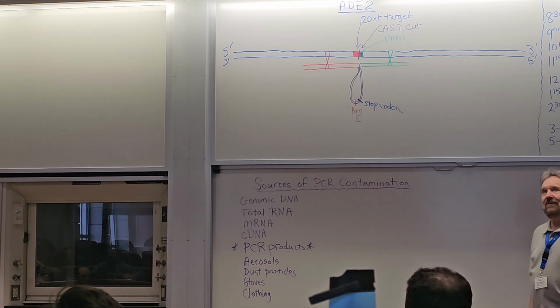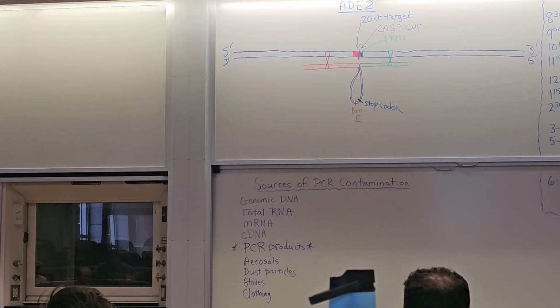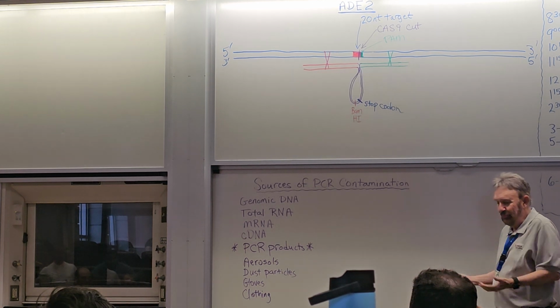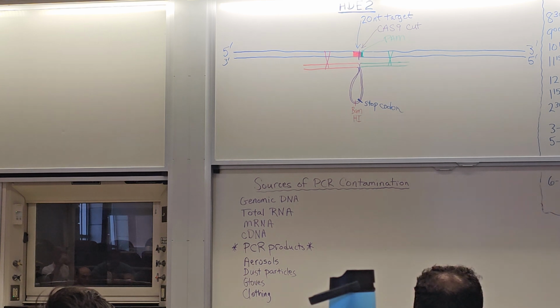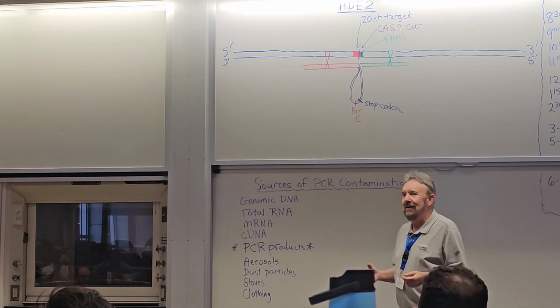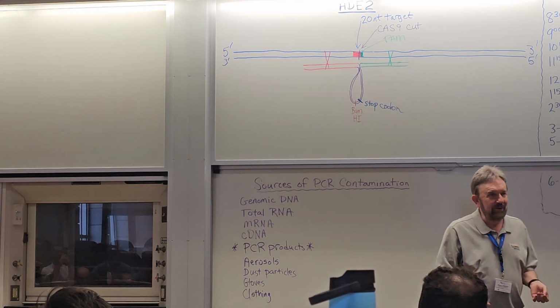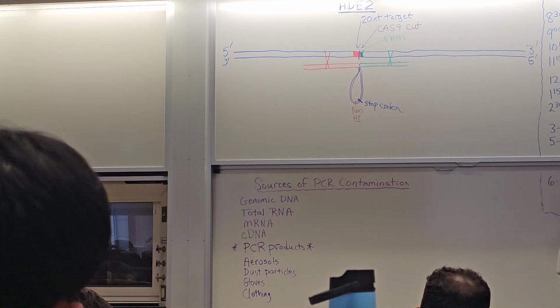So think about your RT-PCR reaction you ran the other day on TPR. Well, why didn't you have contamination? You're working in a teaching lab that doesn't do mouse, right? None of the teaching labs here at Smith use mouse. And so no chance of contamination from mouse. Nobody studies TPR in there. In fact, nobody's done TPR in that lab since the year before, when we taught summer course last year. So the lab that you're working in is a great place to do the PCRs on the various experiments you're doing because nobody's done that sort of work in there since last summer, and the lab's been cleaned a million times since then.